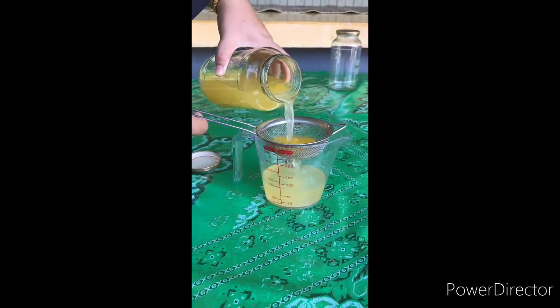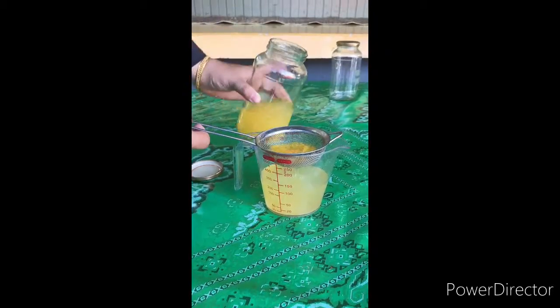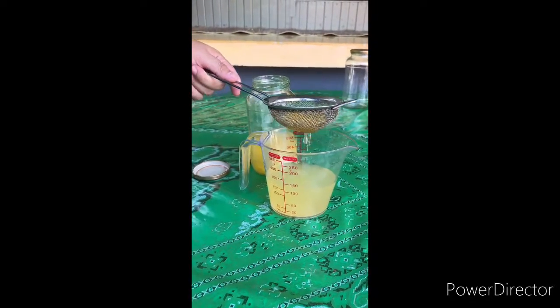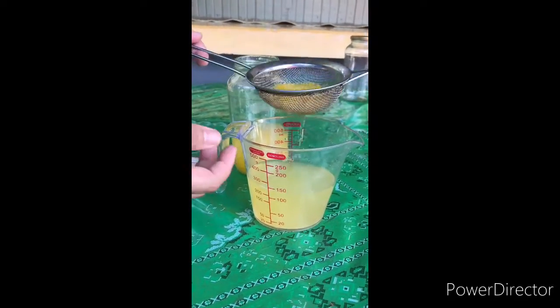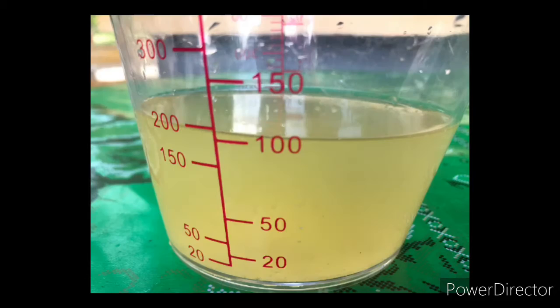Now, we can see that all the pulp has remained in the strainer. The pulp is called the solid retentate. This separation of a mixture with the help of a strainer or a filter is called filtration. But as we can see, the strainer is not able to filter the fine particles, as you see in the filtrate. It is not clear and contains marks.